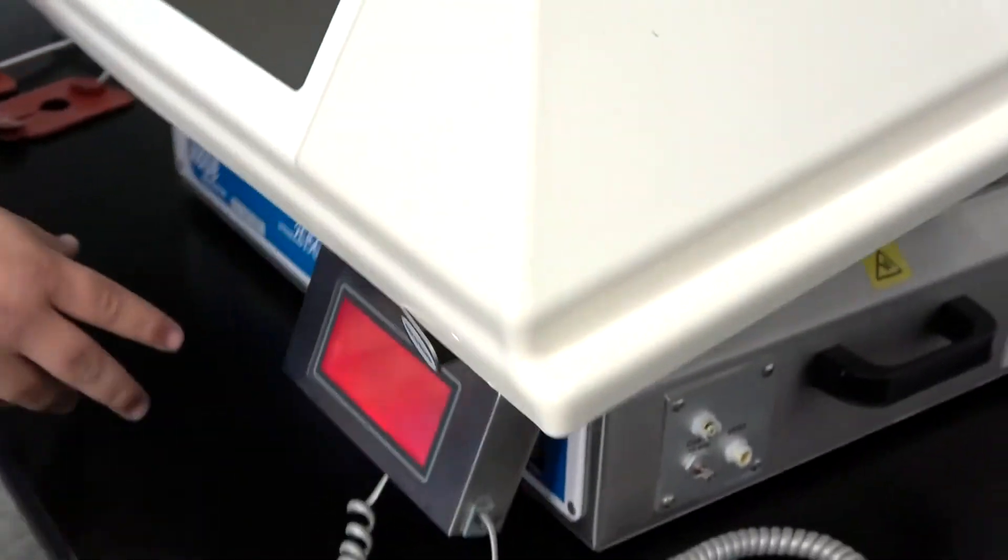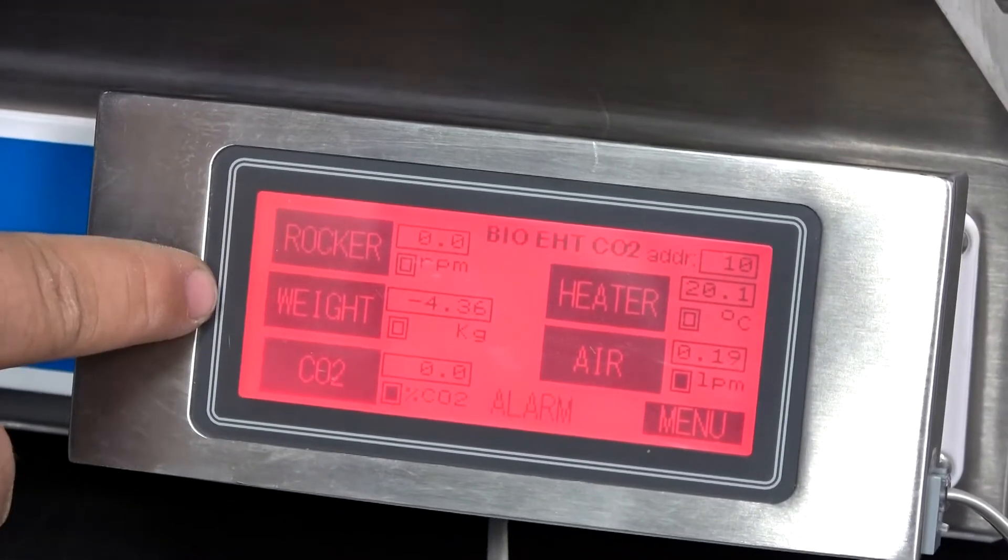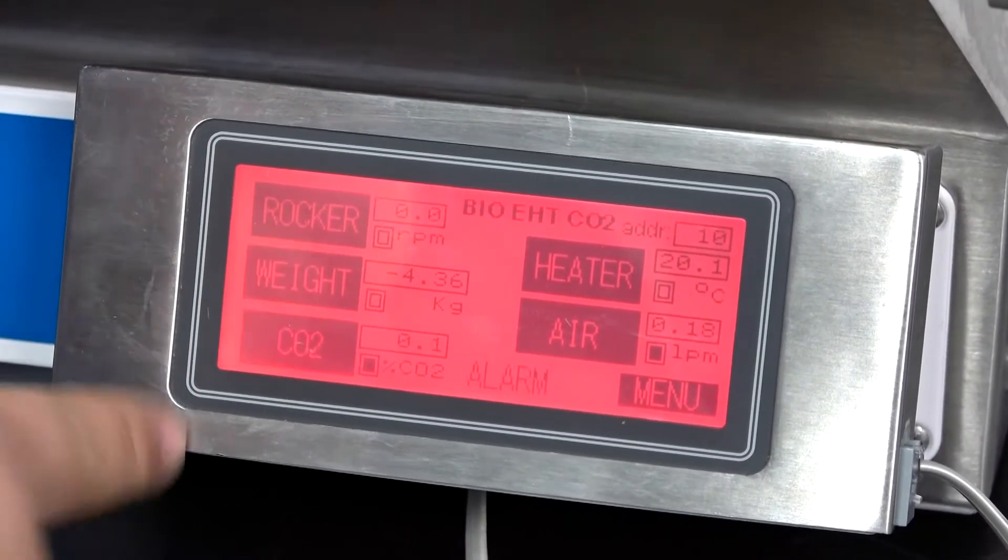When you first turn this instrument on, right here is your control panel. You have your rocker speed, height, your CO2 flow, your heater control, and your air flow control.